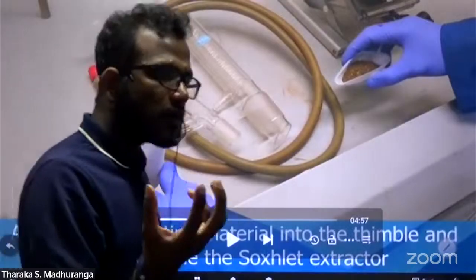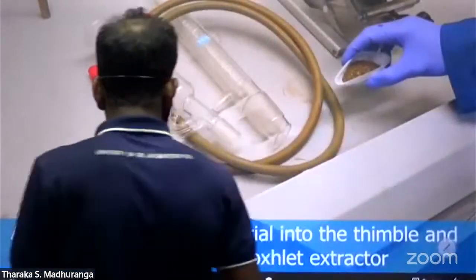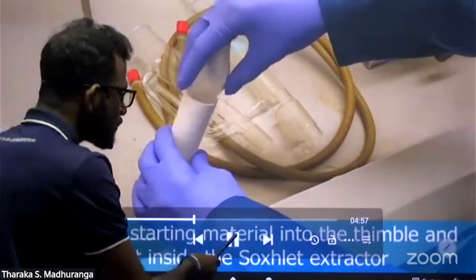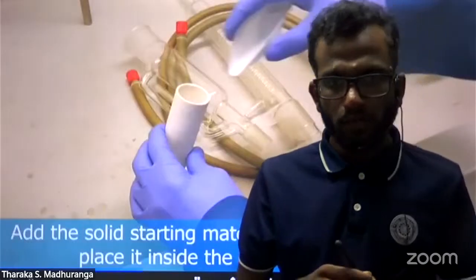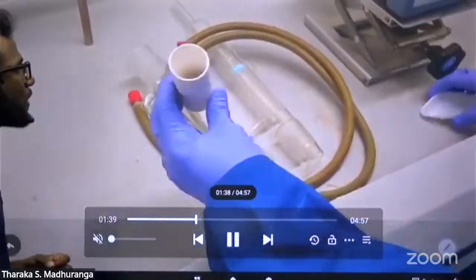The plant material we put into this filter paper cup. This is the plant material. I told you, to increase the surface area, the plant material needs to be cut into small pieces.